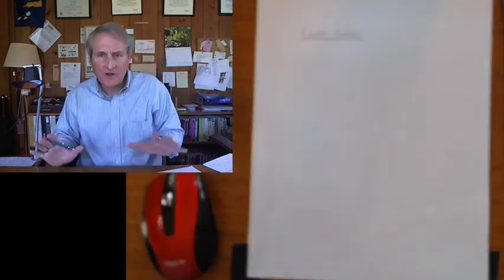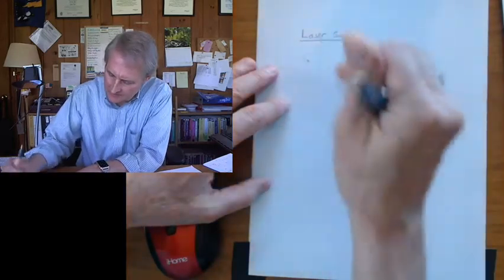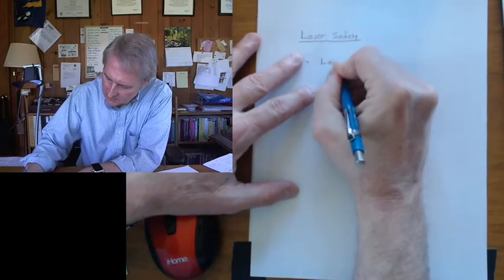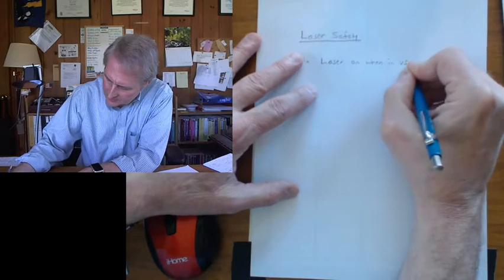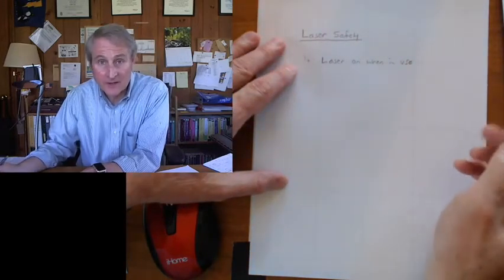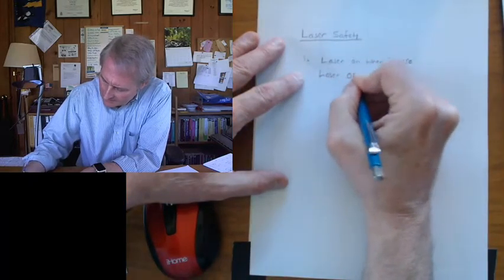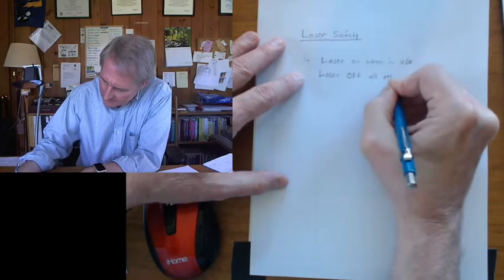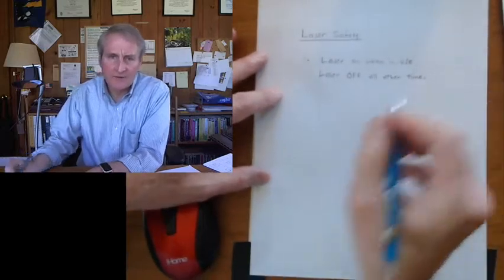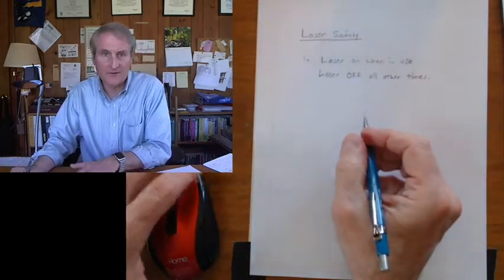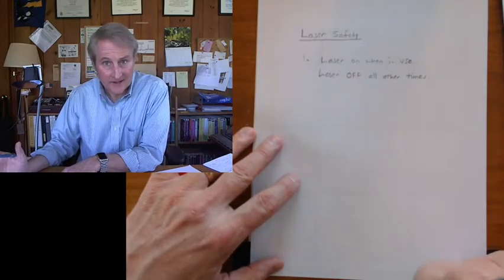First of all, just turn the laser on when you're using it and then turn it off at all other times. I'm doing this the slow way so you can write it in your lab notebook. The idea is that there's no chance of a stray laser beam going into your eye if the laser isn't turned on. You only have the laser turned on when you're using it, and then you turn the laser off.